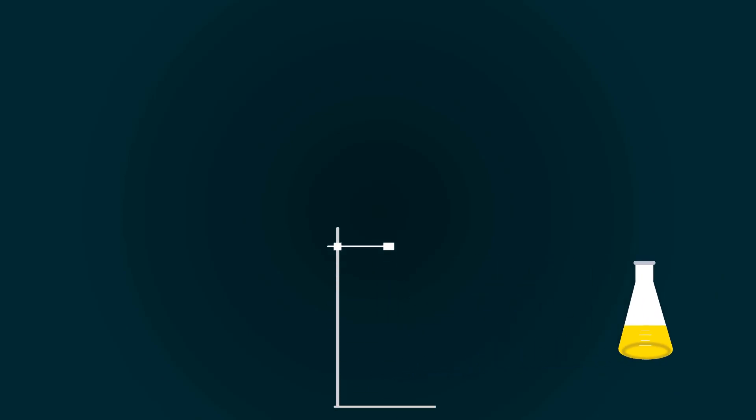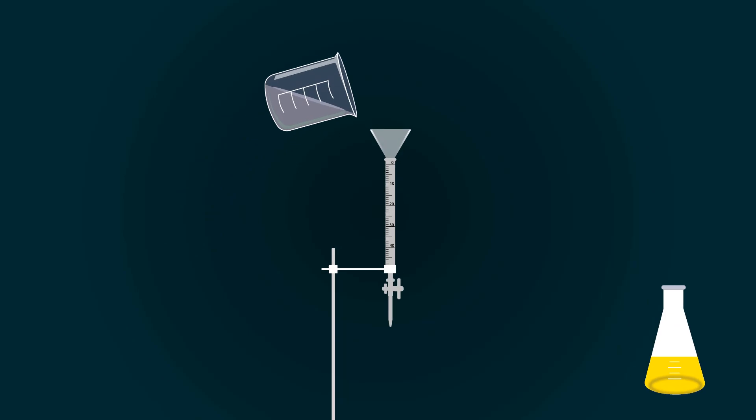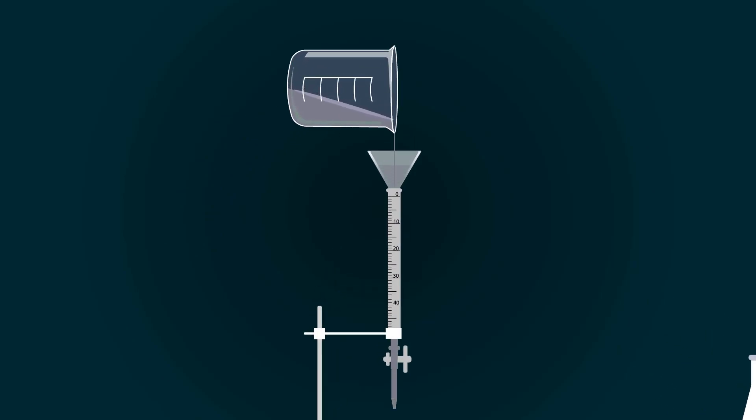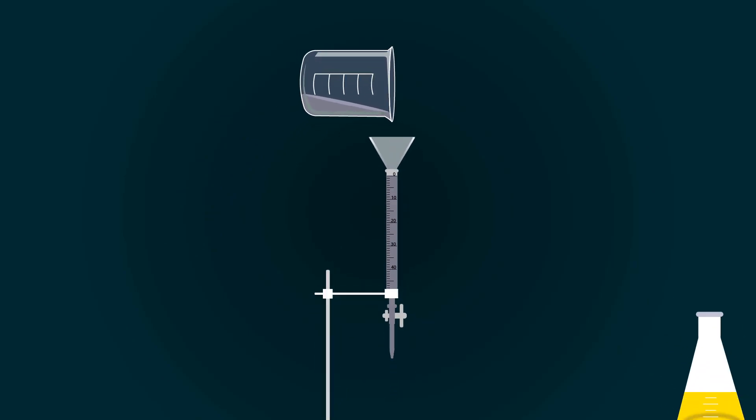Now take the iron stand and adjust the burette into the stand. Put the funnel on top of the burette. Take the 0.1 molar solution of HCl and add it with the help of the funnel into the burette. Fill the burette up to the zero point carefully.